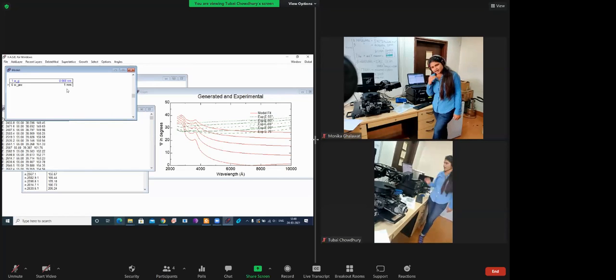We have to add every layer, like in silica, after silica we have to add silicon oxide. Similarly, after tungsten we have to add tungsten oxide. Absolutely, I agree with that, but I am not agreeing with you that instead of the tungsten model we should go for the Cauchy model, because then there is no point of making models for metals.